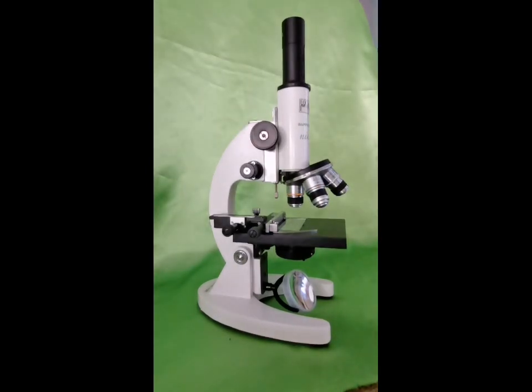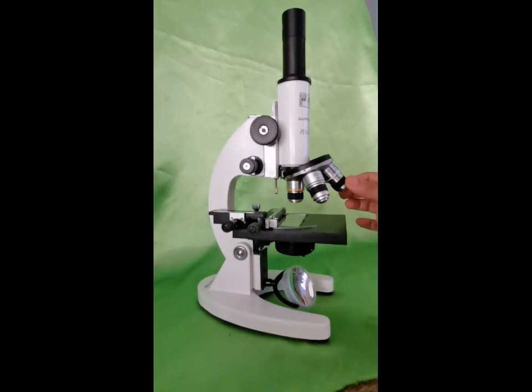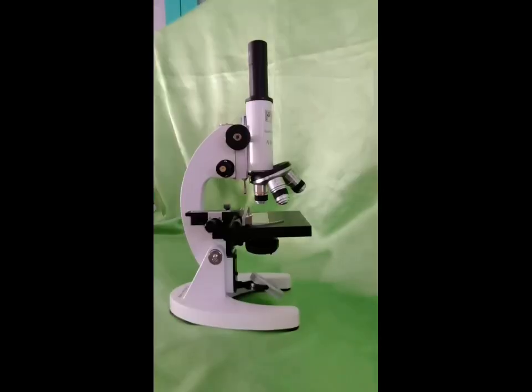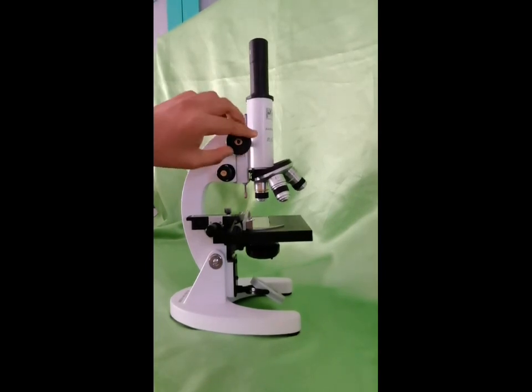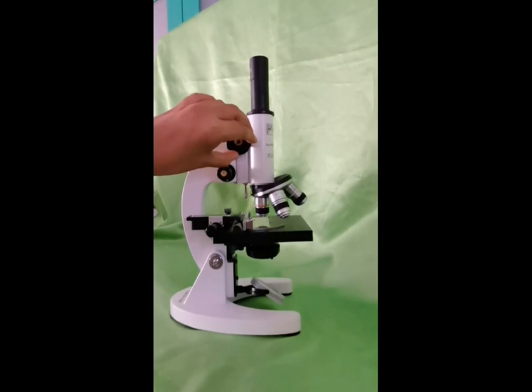The next one is the revolving nosepiece. It is attached to the base of the body tube. It holds 2 or more objective lenses. It can be rotated to facilitate the changing of the objective lenses. Number 8 is the coarse adjustment knob. It is the larger knob and it is used for faster movement when focusing the LPO or the scanner.